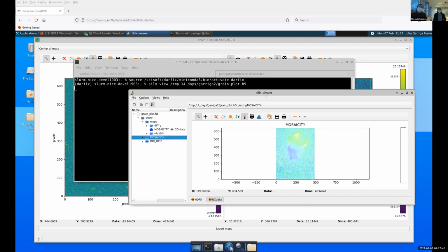And you can load the other widgets that we commented. You don't have the transformation widget in your version, which by the way we forgot to add at this time. But I think we should clean the data again if we're going to try to do the blind source separation operation to have better output, you think?